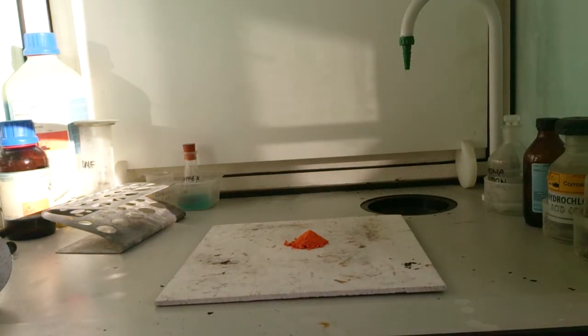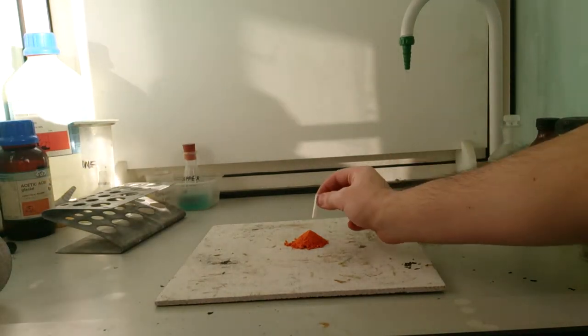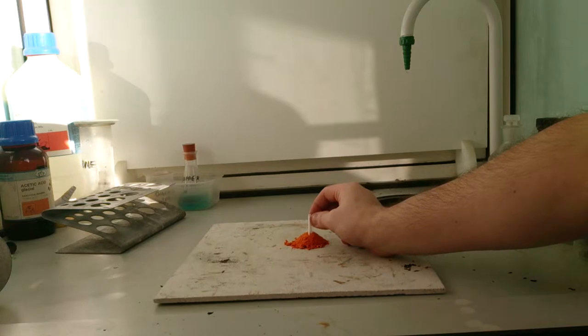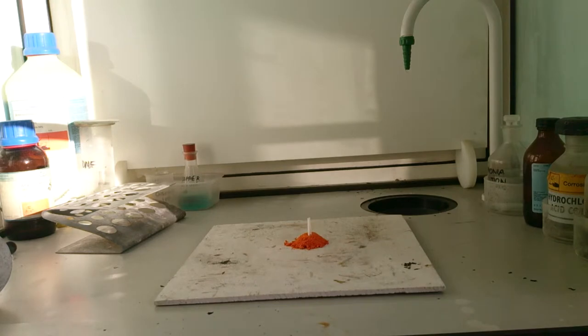Of course, as usual, don't try this at home, even if you could get hold of ammonium dichromate. Now, what I'm putting in there is a small piece of filter paper that's been soaked in ethanol. And that is going to basically act as my fuse.